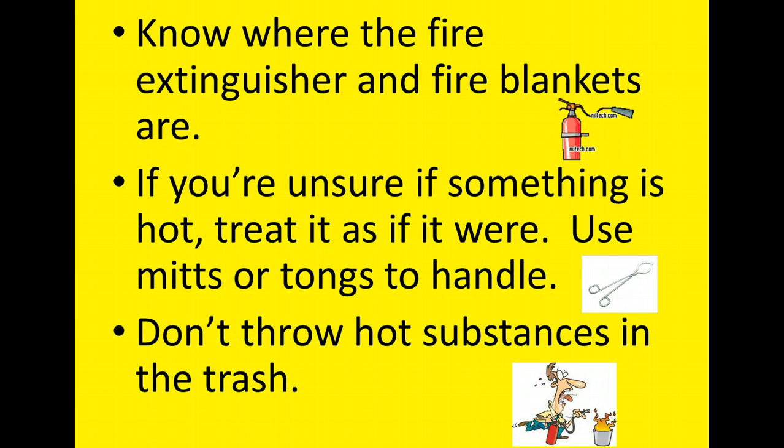And lastly, don't throw hot substances into the trash. As you can see by our little picture, oftentimes that can start a fire because there's all kinds of papers inside the trash can. So if we do have something hot to throw away, we will definitely put it to the side somewhere to cool off, and then when it's appropriate, I'll show you how to throw it away. Okay? But never throw anything that's hot into the trash.